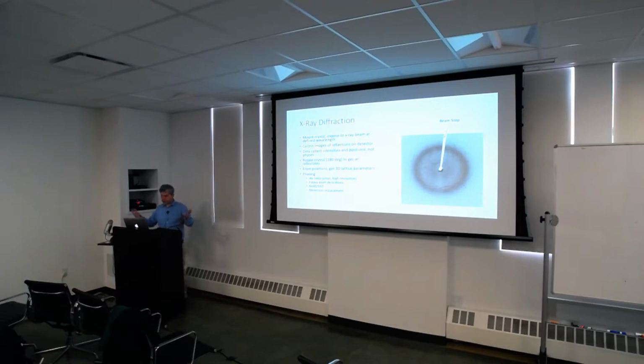And so this is what's been done in X-ray crystallography for decades, and these are all very standard techniques, all very well understood. I guess ab initio is getting better and better as energies get higher and higher, and data gets better and better. But most things, I think, are heavy atom derivatives, MAD phasing, or SAD, and molecular replacement.